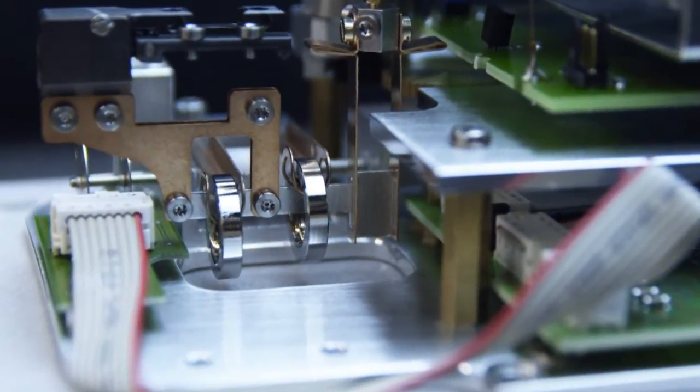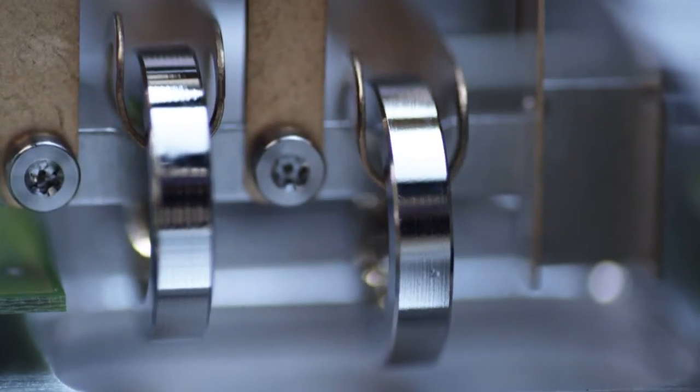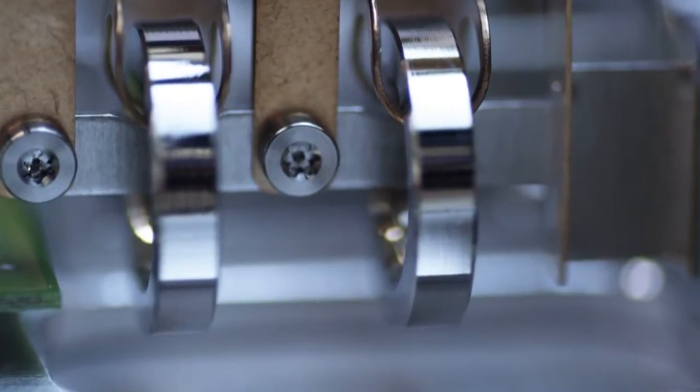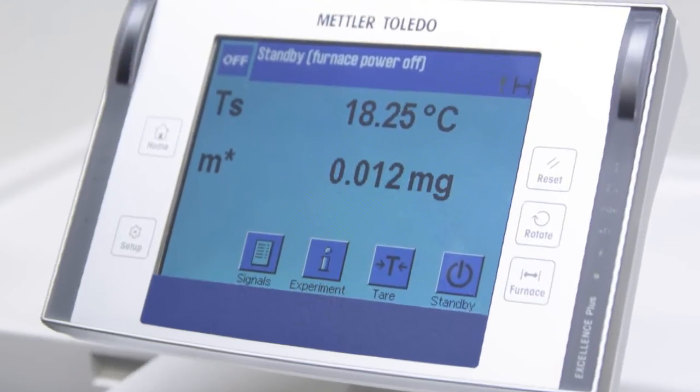Our TGAs use the world's best METTLER TOLEDO micro and ultra-micro balances. The internal calibration ring weights and parallel guided balances guarantee unsurpassed accuracy.